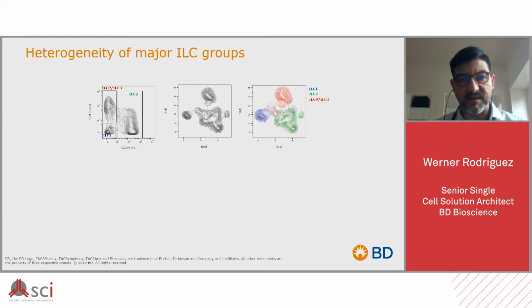And going into the analysis, once we obtained and combined the data coming from the expression of a gene panel composed of 399 genes related to immune expression, together with the 42 antibodies that we saw before, what we did was a combination, a dimensional reduction, and a visualization to allow us to see how every single cell has been grouped into different groups.